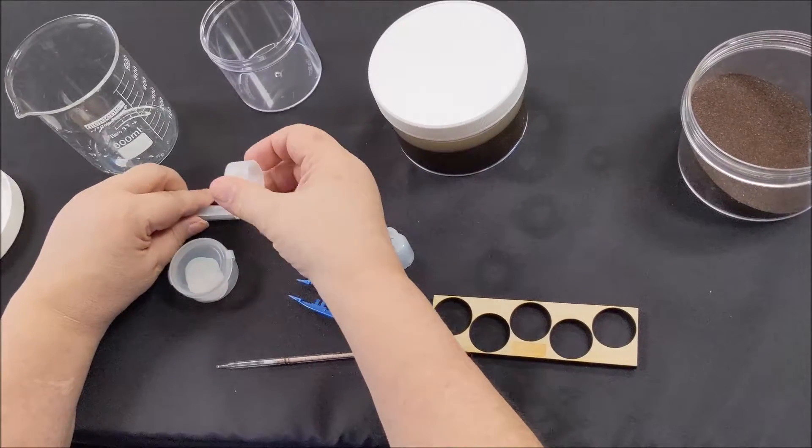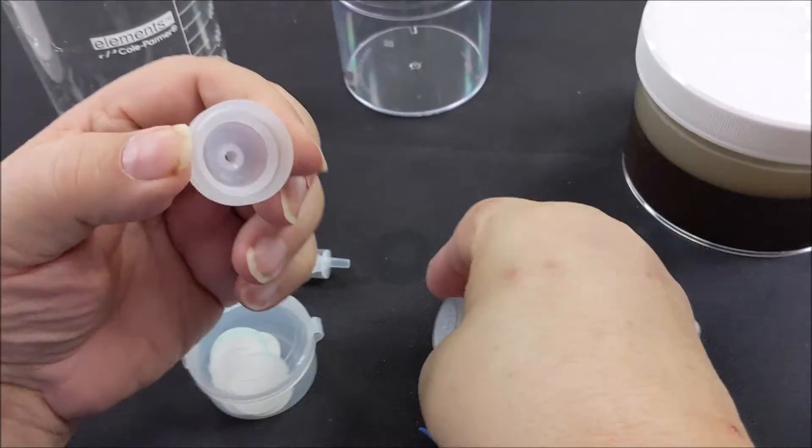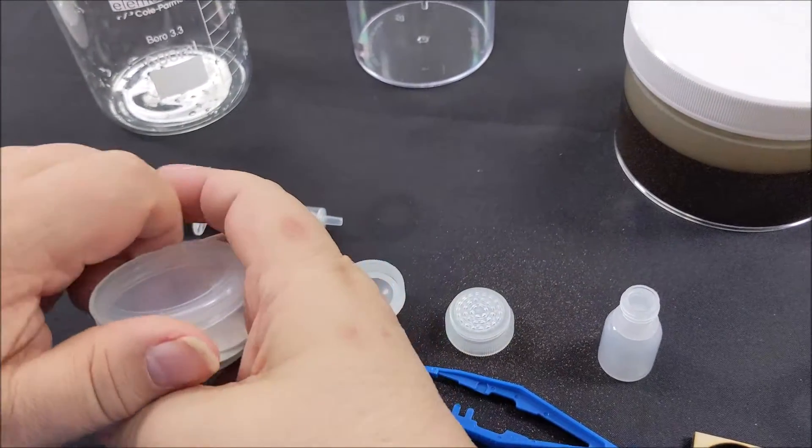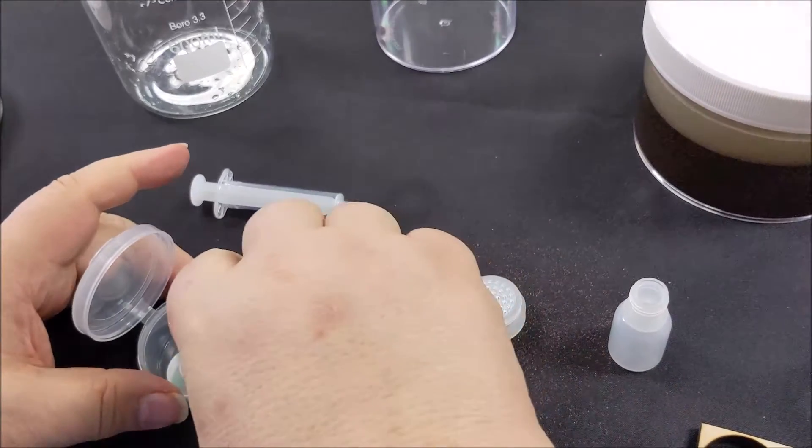While you wait for the 8 minutes, unscrew the syringe filter and put a filter paper into the syringe. Make sure the blue paper is removed using rubber gloves or tweezers to prevent touching the filters with your fingers. You don't want to cross-contaminate the filter.